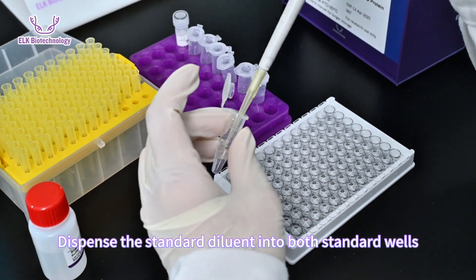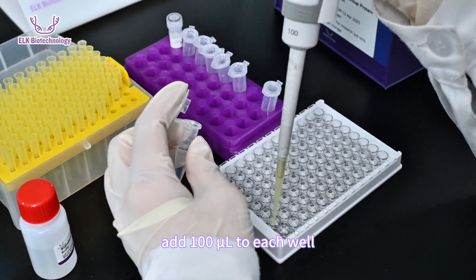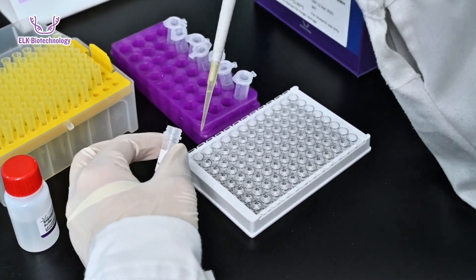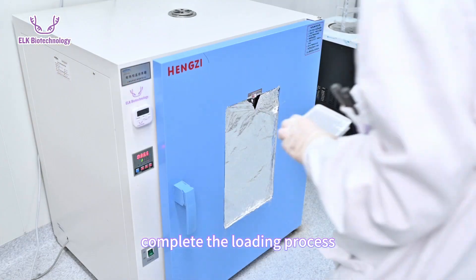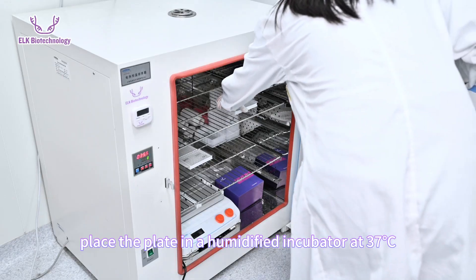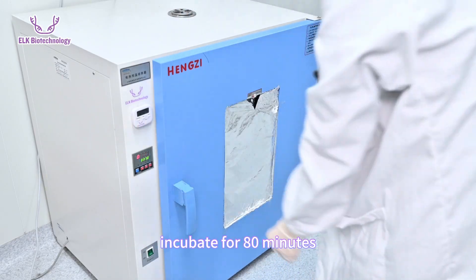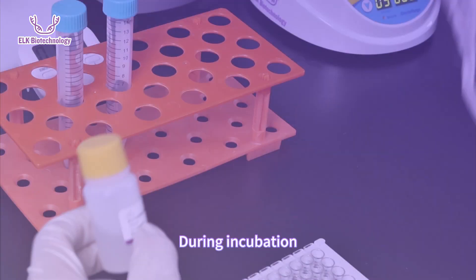Dispense the standard diluent into both standard wells and sample wells, adding 100 microliters to each well. Once the loading process is complete, place the plate in a humidified incubator at 37 degrees Celsius and incubate for 80 minutes.